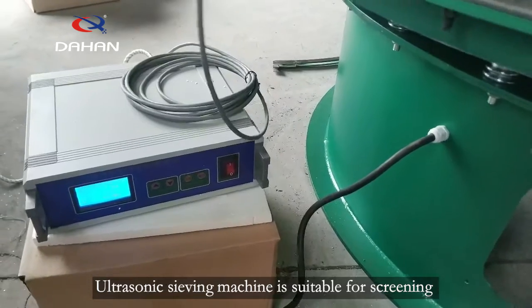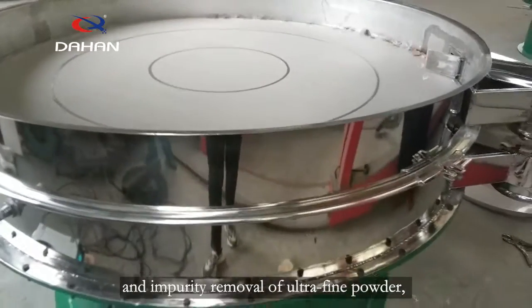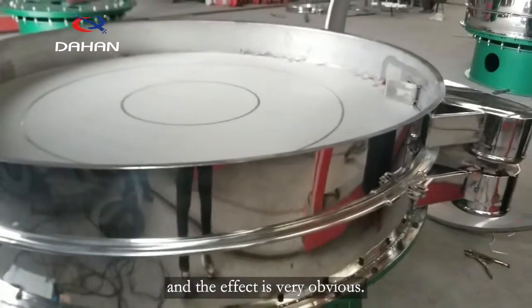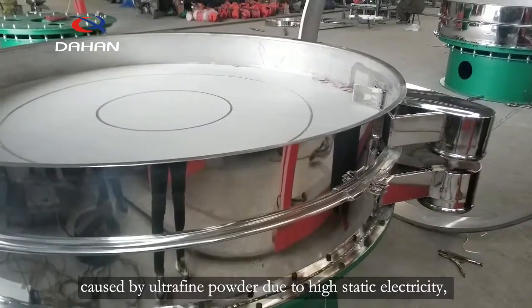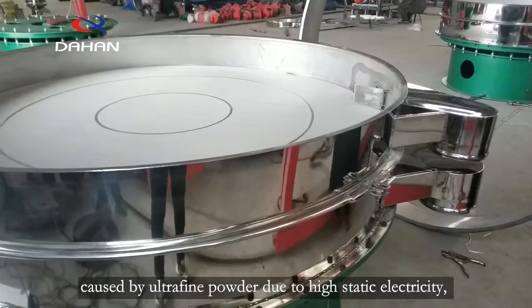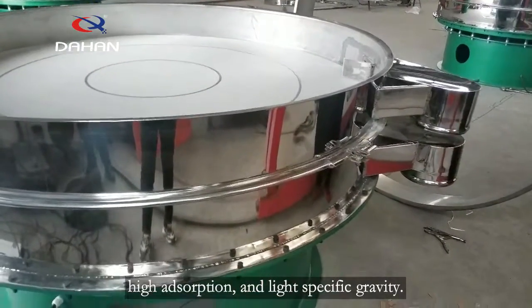Ultrasonic sieving machine is suitable for screening and impurity removal of ultrafine powder, and the effect is very obvious. It effectively solves the problem of mesh blocking caused by ultrafine powder due to high static electricity, high absorption, and light specific gravity.